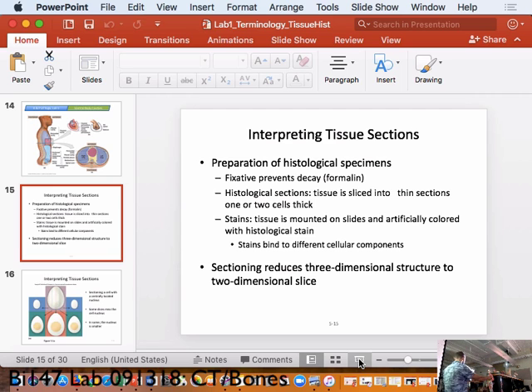So step 1, you reach on the side without looking through the microscope, and you dial the big outer knob towards you. The coarse adjust is going to lower the stage. It's going to lower that stage right now. So dial it towards you. Yep. Dial it right on down. Next, take the objective, the part that has the lenses on it, and rotate it to the shortest one. It should be the 10x. Always start at the lowest mag when you're doing a slide.